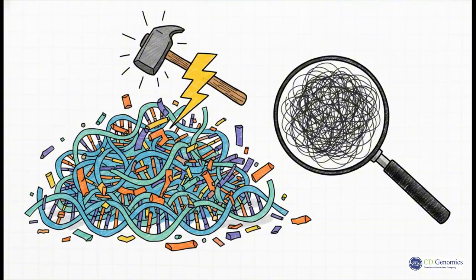So traditional RAD-Seq processes are inherently a bit messy. They rely heavily on physical interruption methods like sonication, along with arbitrary fragment size selection, which usually sits somewhere between 300 to 1,000 base pairs. Plus, you have these incredibly complex, multi-step DNA isolation and purification processes. The result is highly divergent fragment lengths and completely non-uniform sequencing depths across your different tags. To make matters worse, the data analysis quickly turns into a nightmare of false positives caused by repetitive sequences, and those older methods really struggle to filter them out effectively.